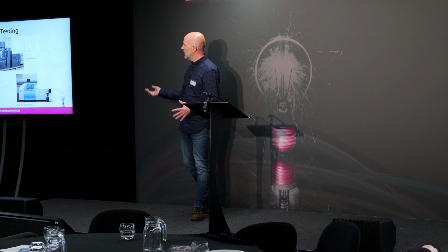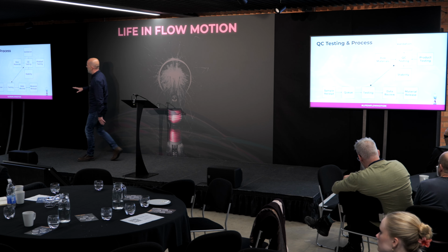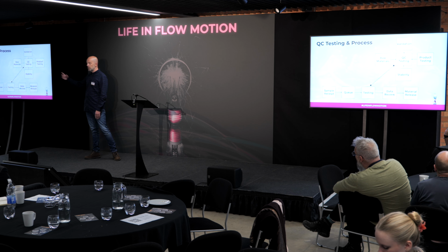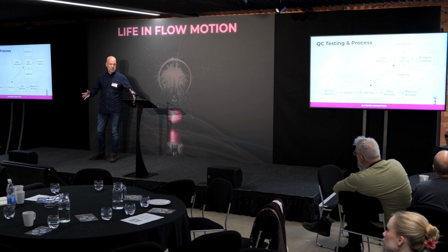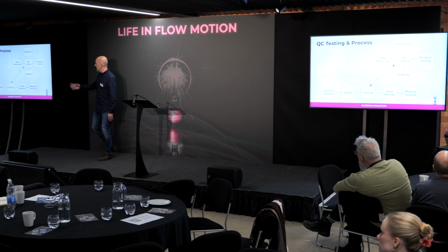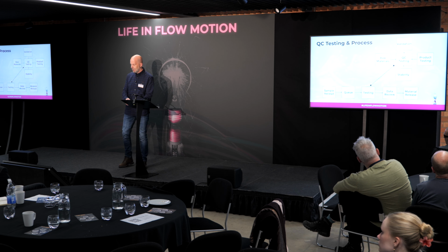So when you look back on the previous slide, just go back one. Every sample, doesn't matter what it is, whether it's a raw material, a product, validation, or stability, sample enters the lab, goes into a queue, the testing is done, and that's the value add bit for the person, preparing the samples. Then they're analysed using high levels of automation. Then the data is interpreted, processed. The data has to be reviewed. Again, there's a compliance aspect to that. Then the material is released. So everything goes through that 5-step process.